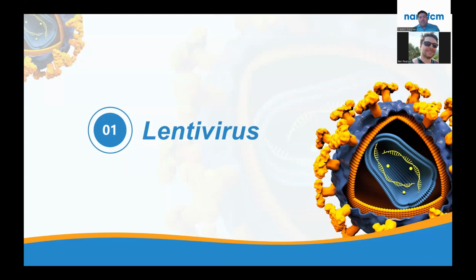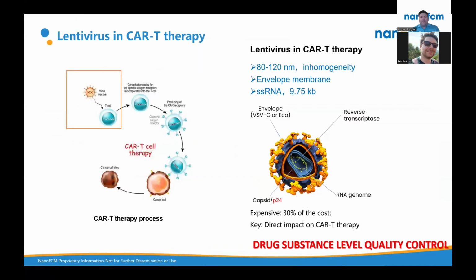And lentivirus is a big one. Let's start there. What type of lentivirus samples are we readily analyzing, or where does the interest come from? The lentiviruses we mainly handle are related to CAR T therapies. I'm not going to sit here and give an exposé on CAR T.